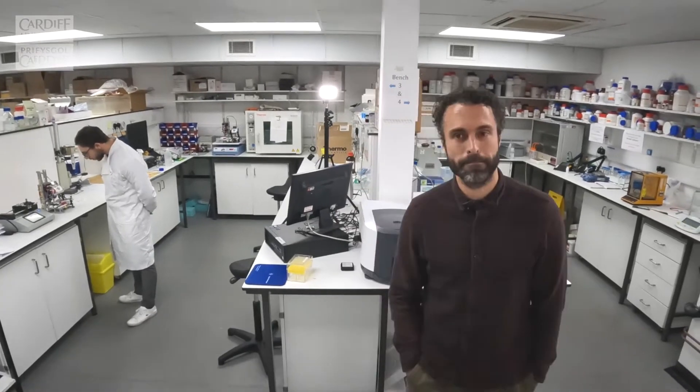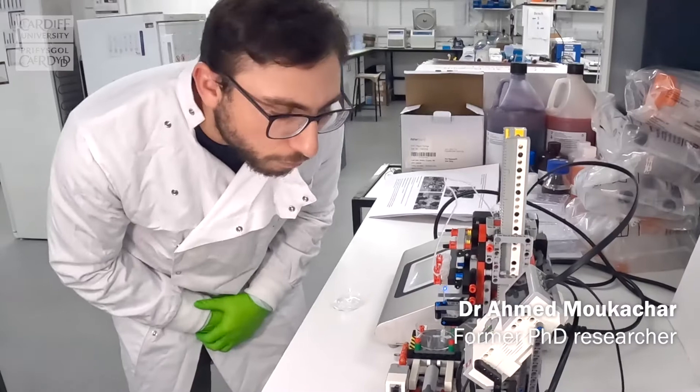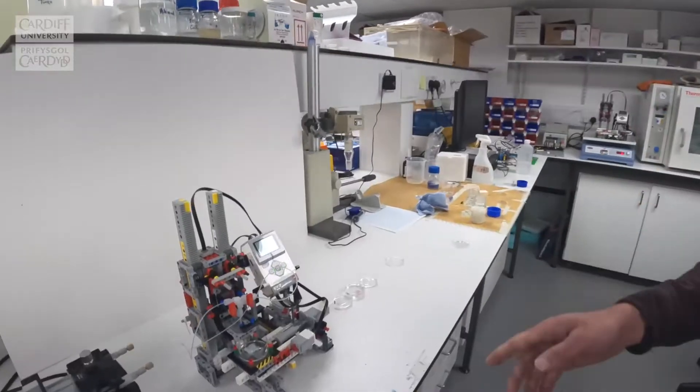Shall I take you over to see the Lego printer? I should introduce Dr. Ahmed Moukachar, who's done lots of the work on this particular printer — and this is the Lego printer here itself.